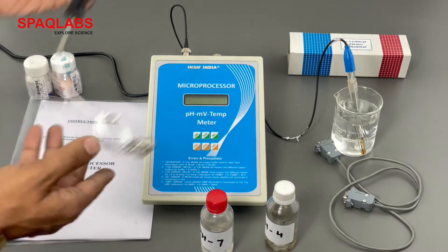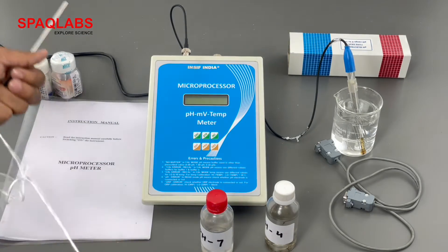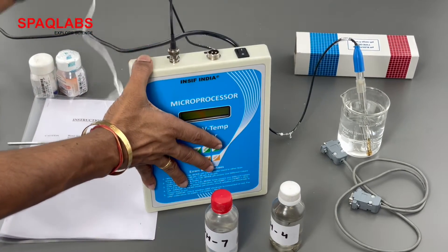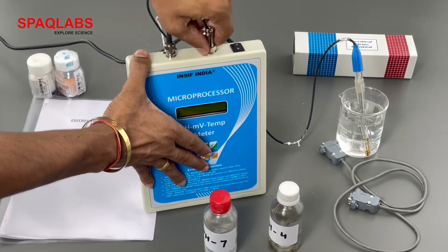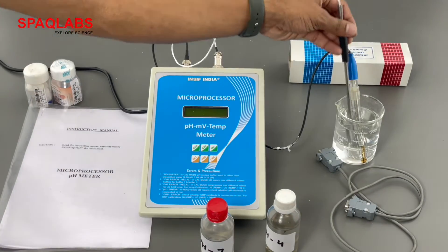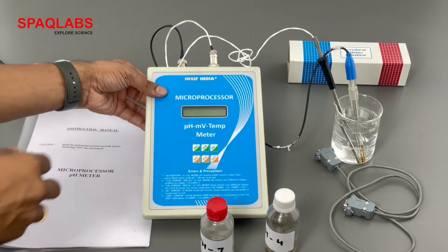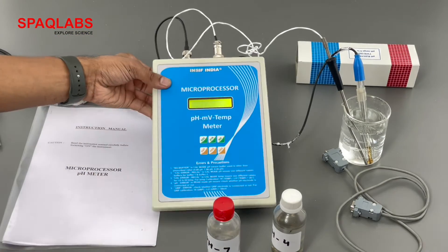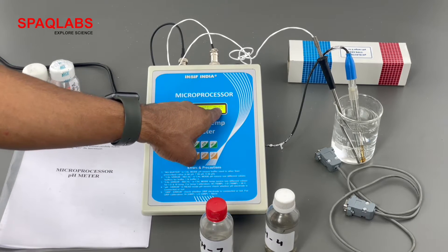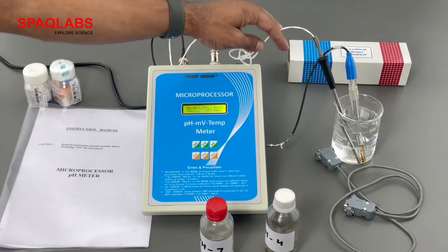Now we have this temperature probe. Connect this probe to the back side of the pH meter. Also connect the BNC to the back side of the meter. Now switch on the pH meter using the on-off switch. As you can see on the top right-hand side, 'auto' is displayed, which is for the temperature probe.